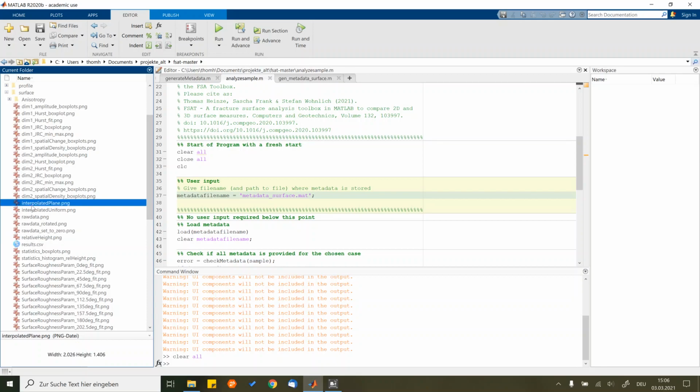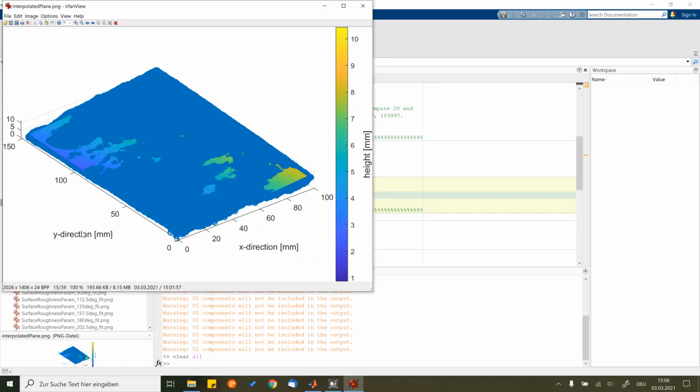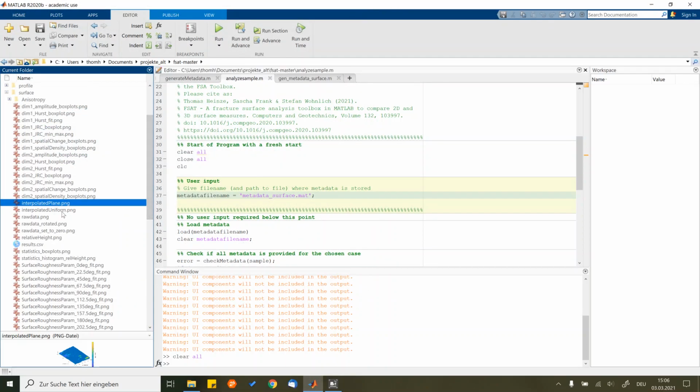And then, as you already know from the 1D profile, you want to remove general trends. So you want to have everything to one common mean surface to remove general trends, that you can see here. It's just showing, okay, there are a few points up and above, but it's mainly to show that everything worked.